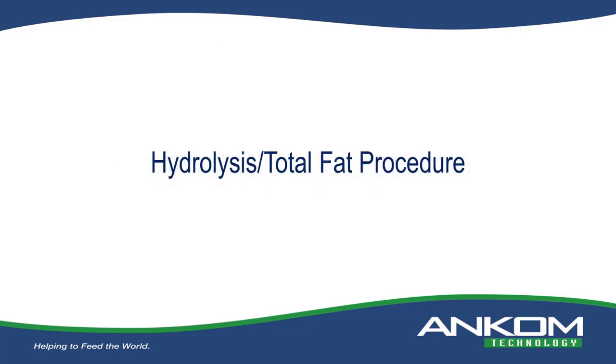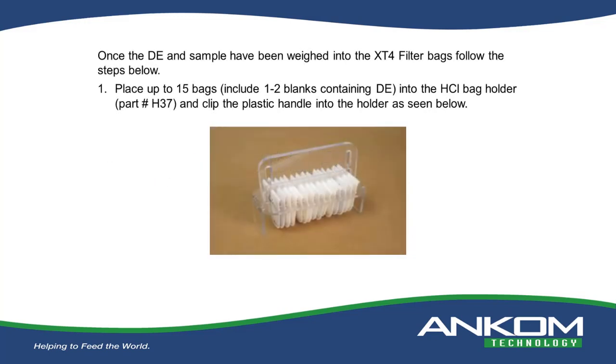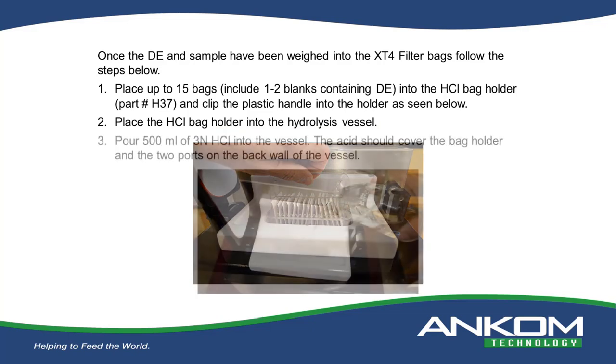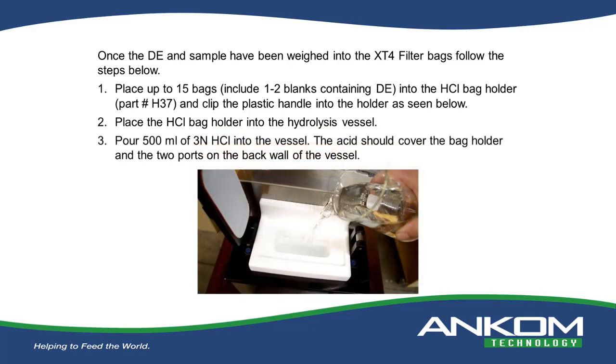The hydrolysis total fat procedure. Once the DE and sample have been weighed into the XT4 filter bags, place up to 15 bags, including, we would suggest, 1 to 2 blanks containing DE, into the HCl bag holder, and you can see that down below here, and clip the plastic handle into the holder. Place the HCl bag holder into the hydrolysis vessel. Pour 500 ml of 3 normal HCl into the vessel.